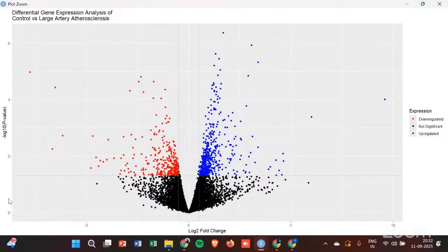On the other hand, a p-value of 0.001 translates to a negative log p-value of 3. Between 0.05 and 0.001 the difference is so low you won't even be able to see it. But a difference between 1.3 and 3 is pretty large, a difference of 1.7. The graph is more spread out, which helps you visualize it better. That is exactly why we transform the y-axis and don't just plot the original p-value.